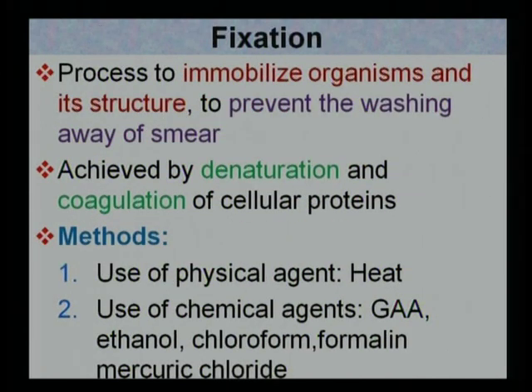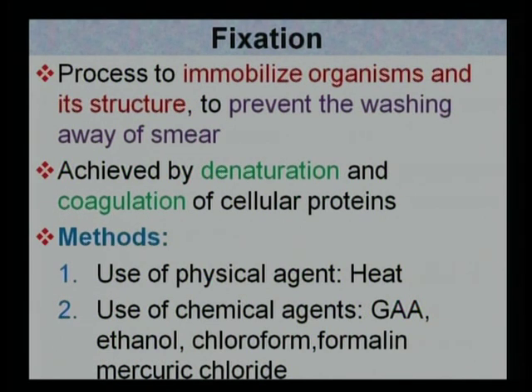Now, for any staining technique, fixation is a very important part of staining. Before we begin the staining procedures, it is necessary to fix the slides. Why? To prevent the washing away of the smear.